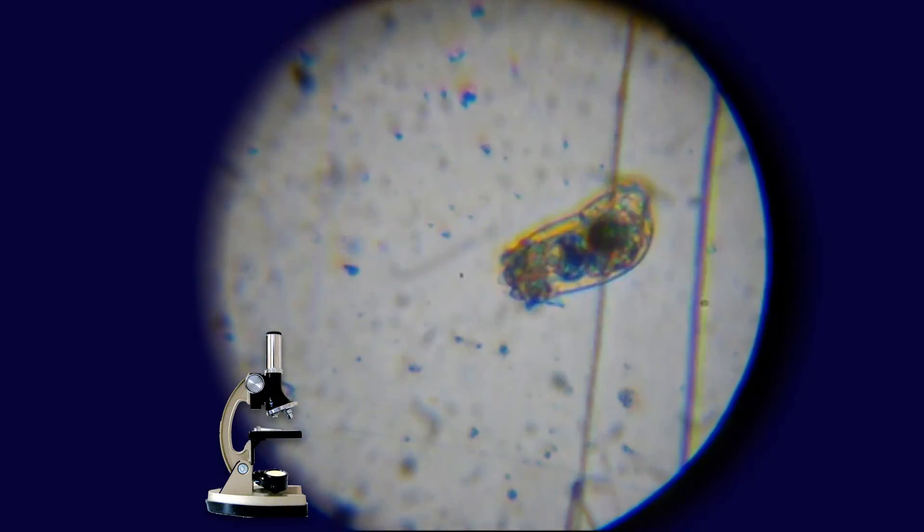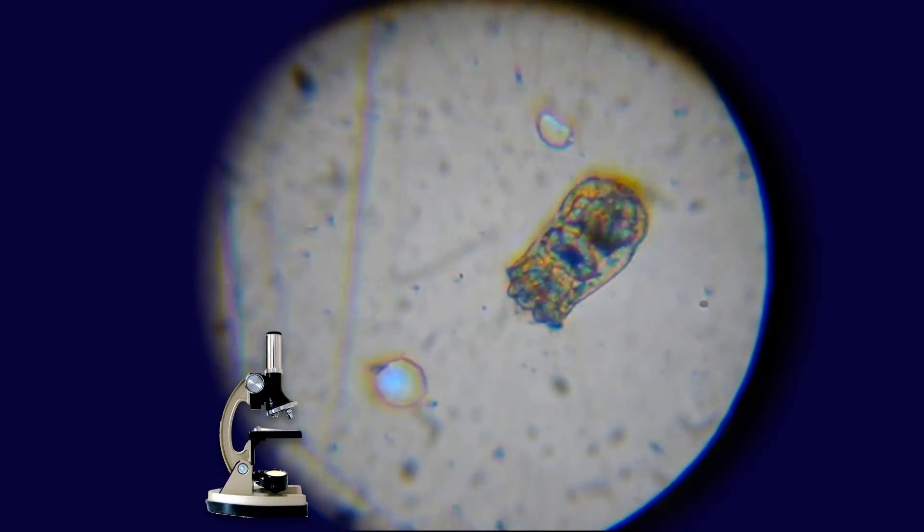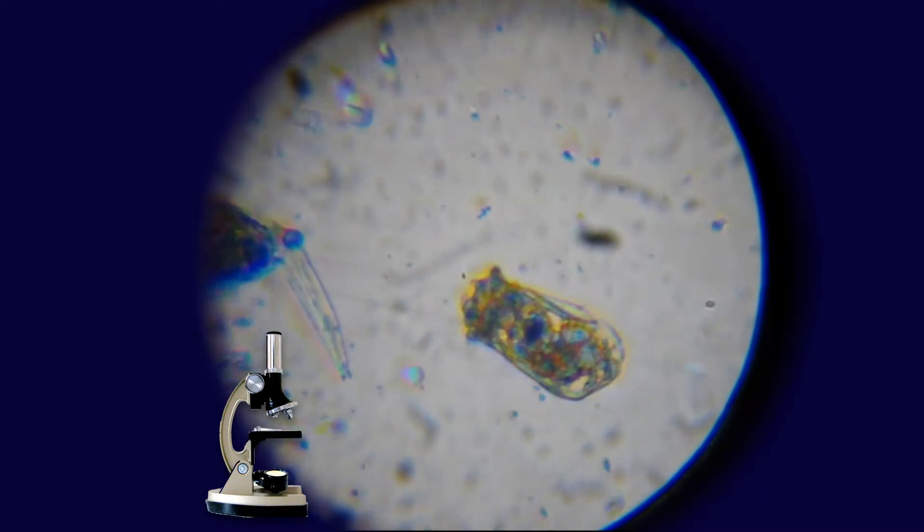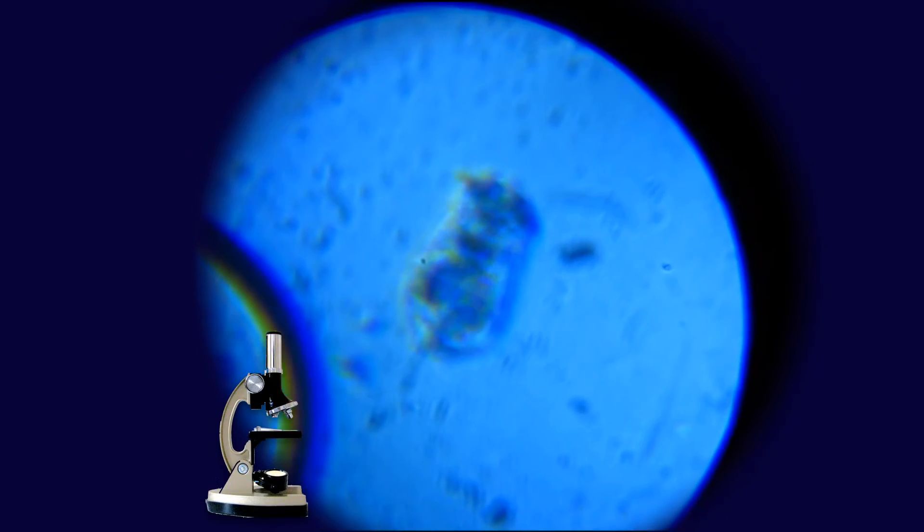So you do need quite a lot of patience, normally, to find what you're looking for. But isn't it amazing? Those animals just swimming around without a care in the world.